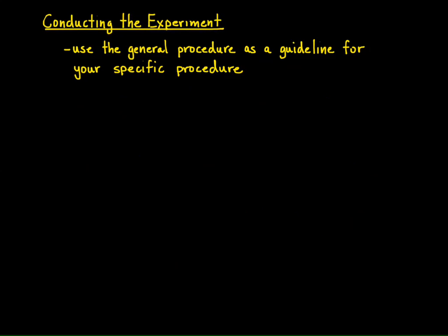A general procedure of an aldol condensation is provided in the lab manual. You will want to use this as a guideline for your specific reaction. Make sure you think about the difference in stoichiometry between your reaction and that provided in the general procedure.